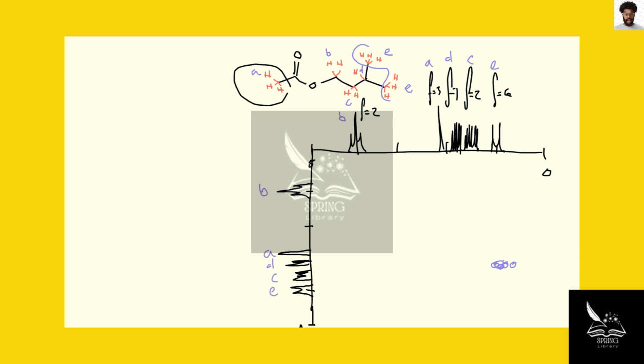In its left and right shape it should look like a doublet, but in its up and down shape it should look like D, which is crazy because D is talking to all kinds of protons. It would be a septuplet. Okay, so we'll just go down the list.